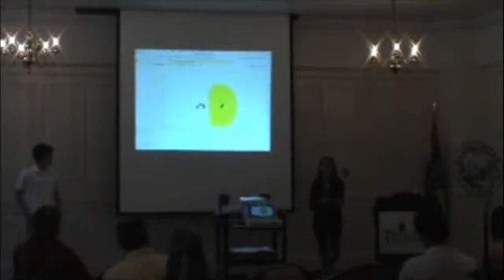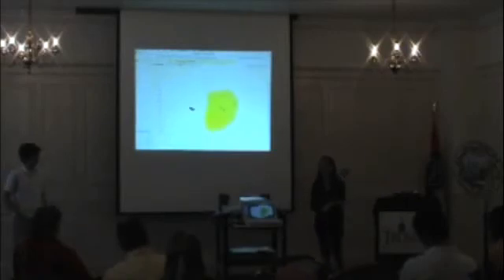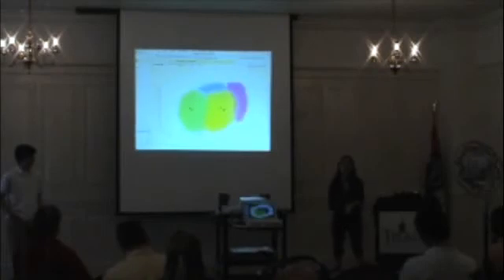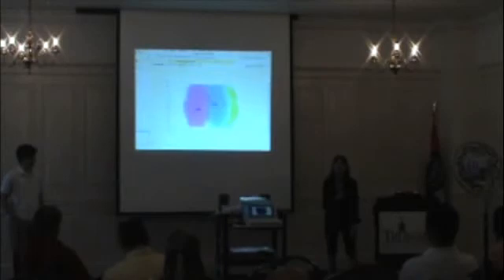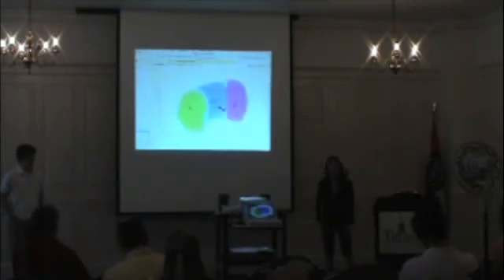When Clayton ran into this problem last year, where they were like, man, this is taking a long time to segment things, shouldn't there be an easier way to do this? He found a paper on level sets and was like, hey, this is really neat. We could maybe use the nucleus. So that was kind of our starting point for research, and we found a lot of other region-growing methods similar to that. So you might look into that. Might ask you about it later, because I'm really interested in learning all I can about the best segmentation techniques.